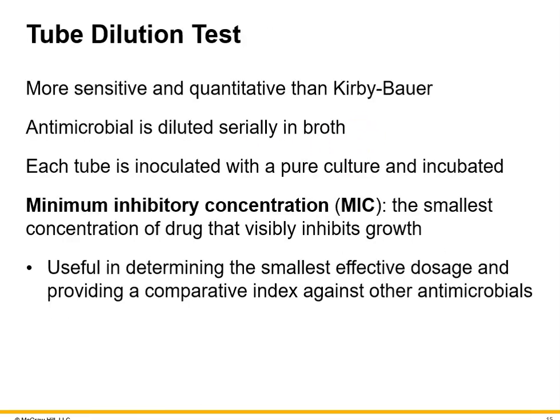We also mentioned there's the tube dilution test. As it says, this is more sensitive and quantitative than the Kirby-Bauer. The antimicrobial that is being evaluated is diluted serially in a broth, so we're using a broth instead. And I'll show you what this looks like in the next image.